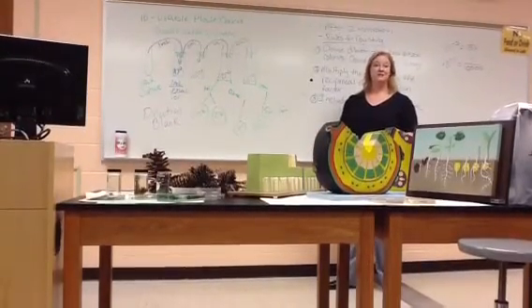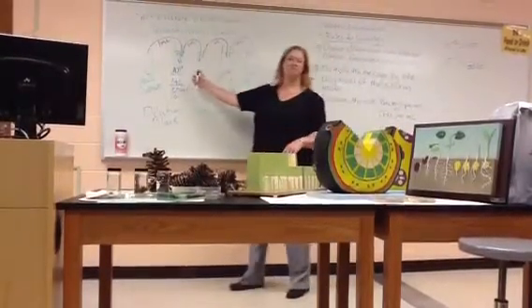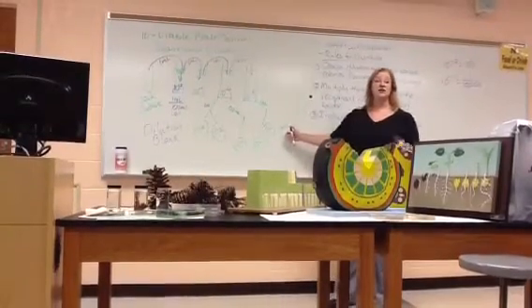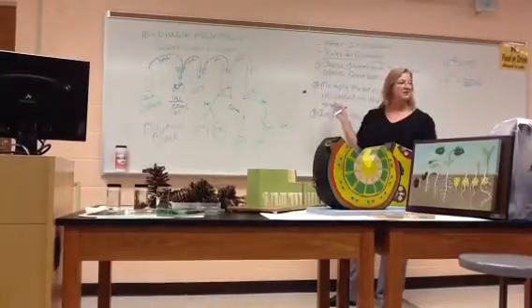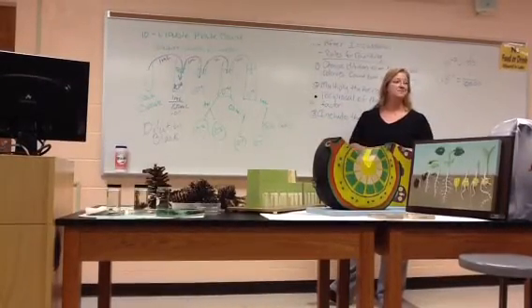Are we wrong sometimes? Yeah, sometimes we do this and we don't get any growth. We should have plated this one, right? Sometimes the 10 to the minus 8 looks like your tube 1. It's so covered with bacteria we have to dilute it even more to get isolated colonies. But this is a good average to start from.